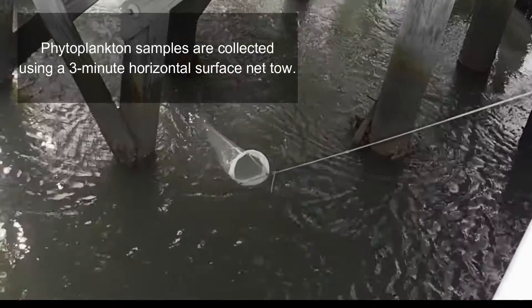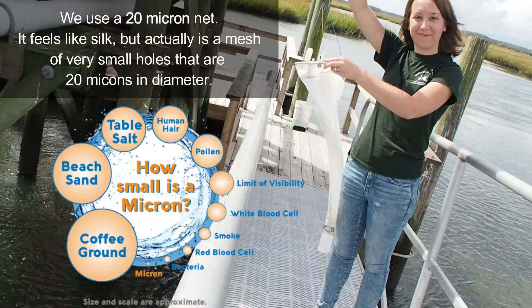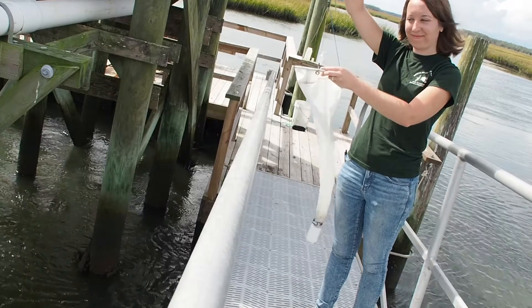Phytoplankton samples are collected using a 3-minute horizontal surface net tow. We use a 20-micron net. It feels like silk, but actually is a mesh of very small holes that are 20 microns in diameter.